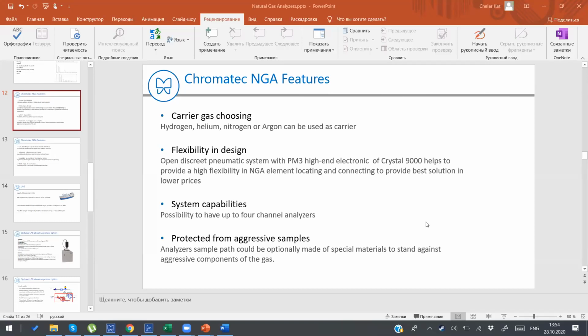A question about LIMS software. We can send the data automatically to any LIMS software because the software can automatically save the data in different formats. But we don't have a driver to control the GC from any LIMS. So LIMS will accept the data from our GC, from our software, but LIMS will not drive it. We need to use our software to drive the GC.